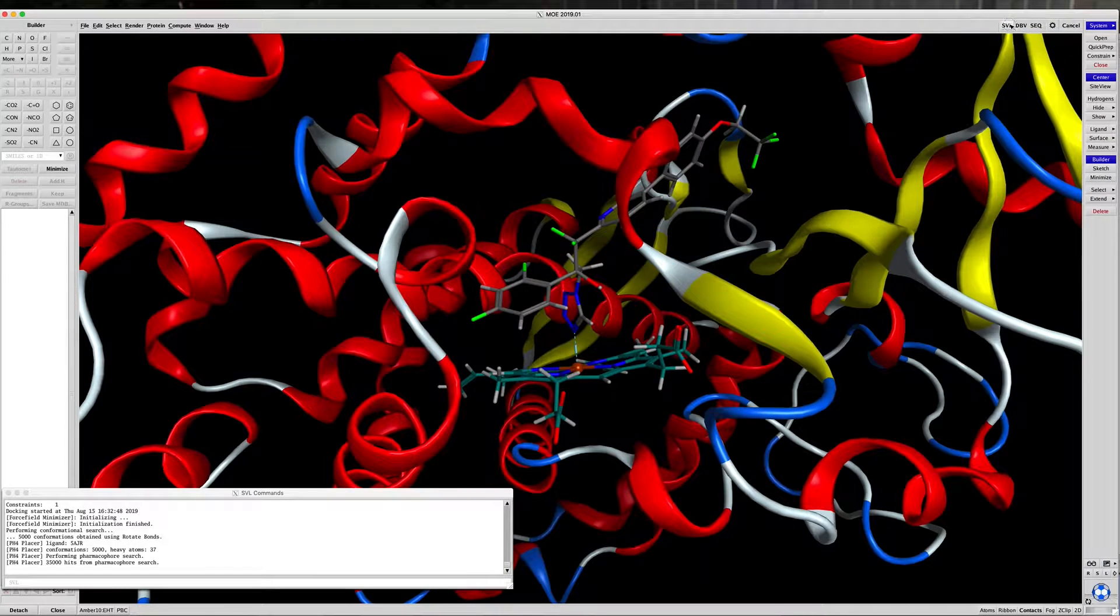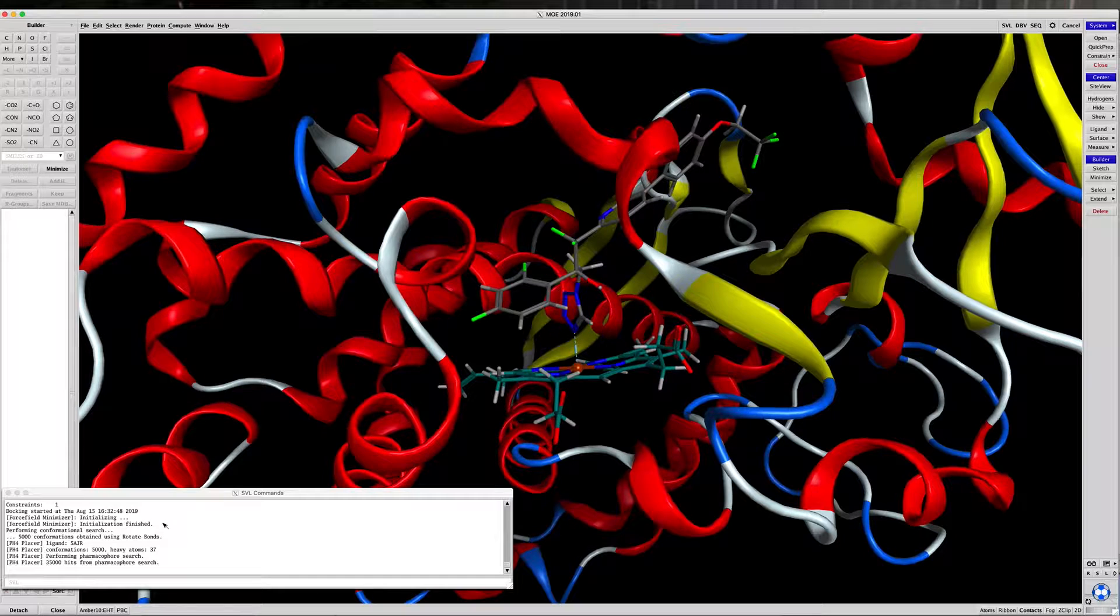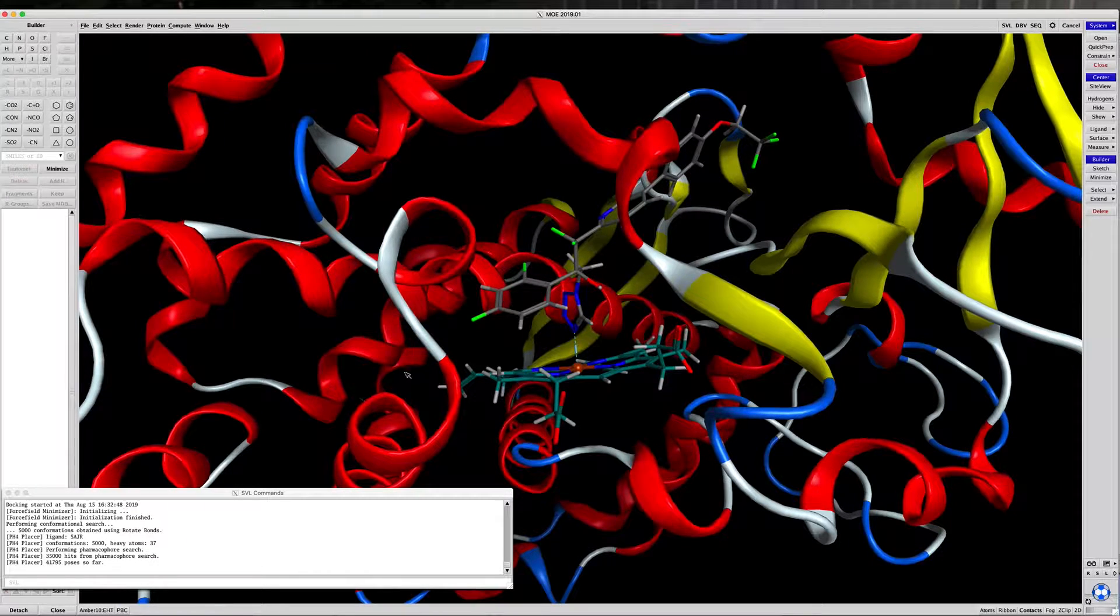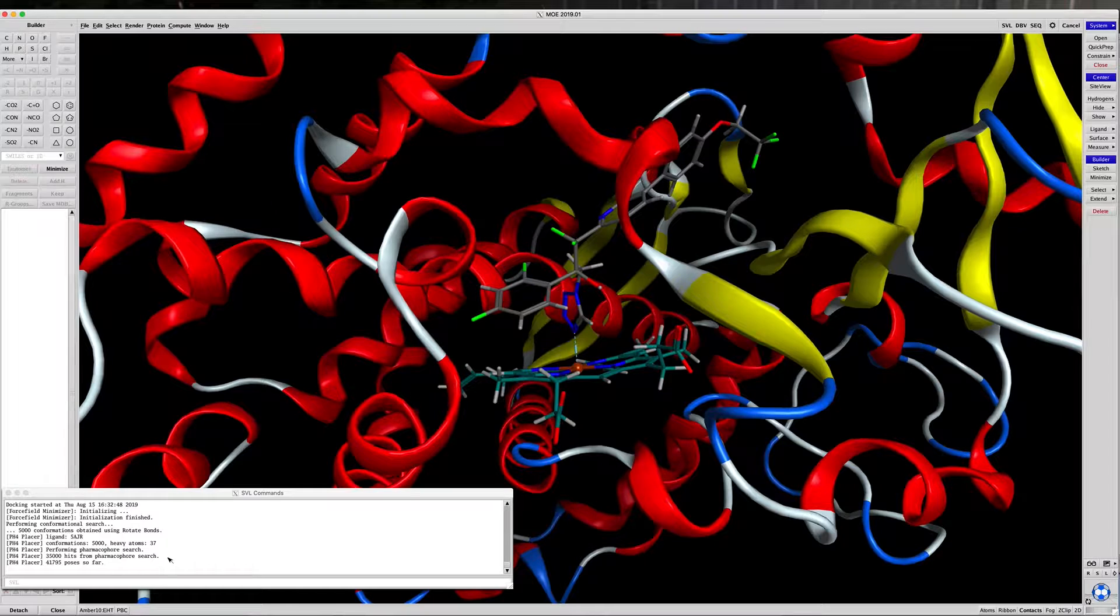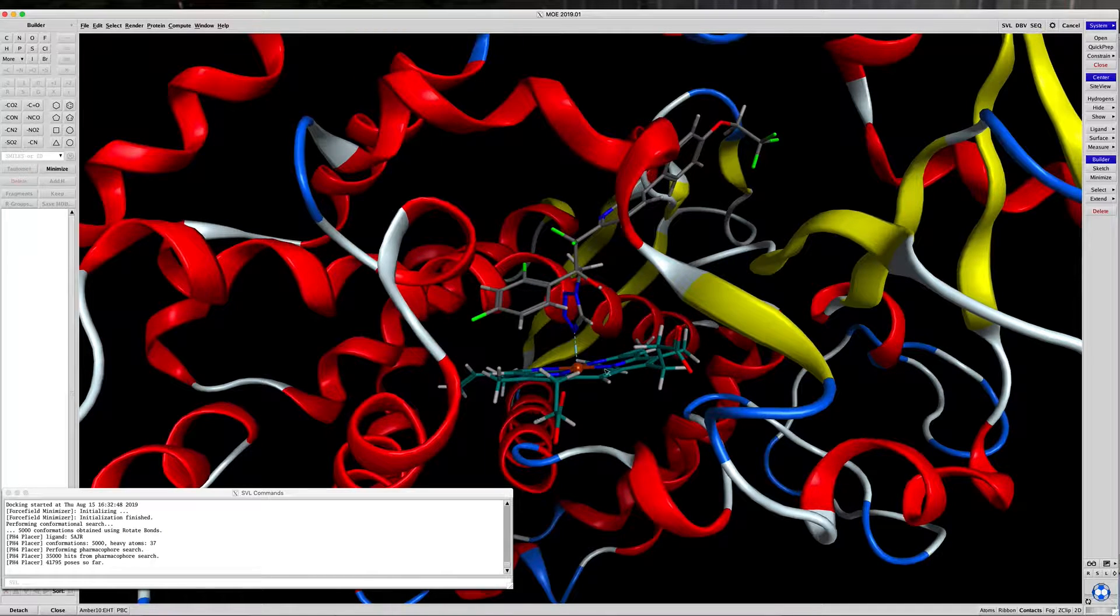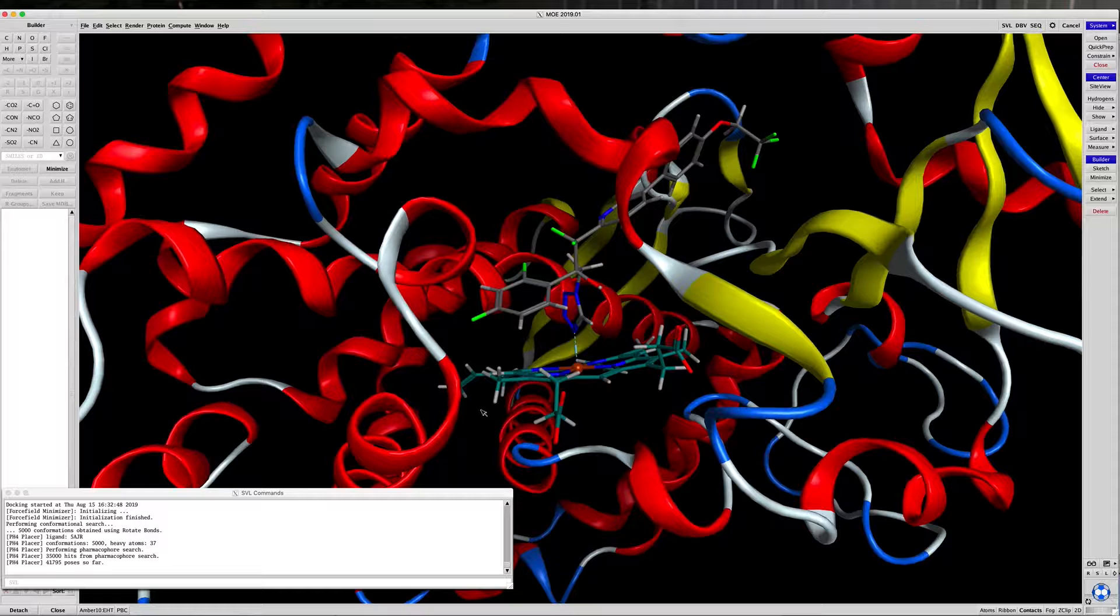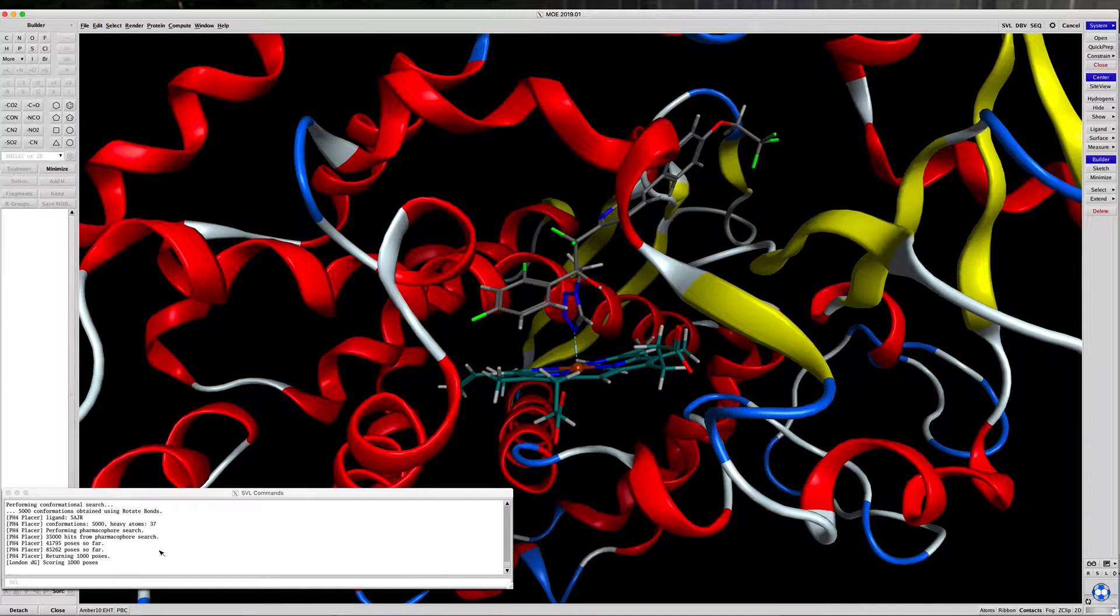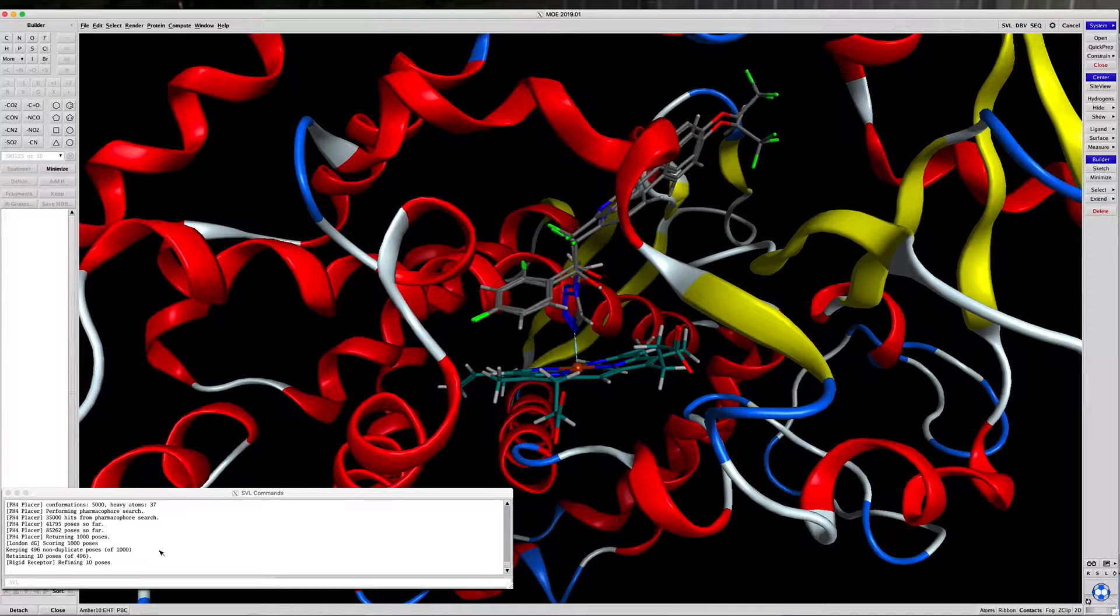It takes a little bit of time to do the pharmacophore search, because it's placing 5,000 confirmations into a pharmacophore search. So it takes a little bit of time. This will take closer to 30 seconds instead of the 15 to 20 that the original search did.